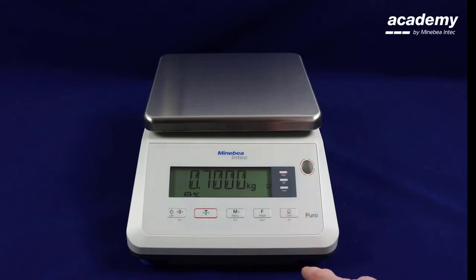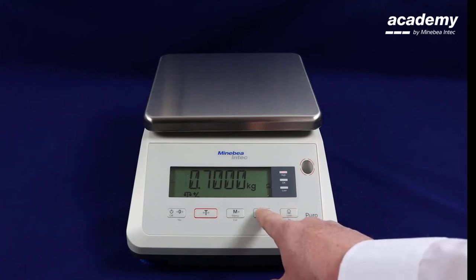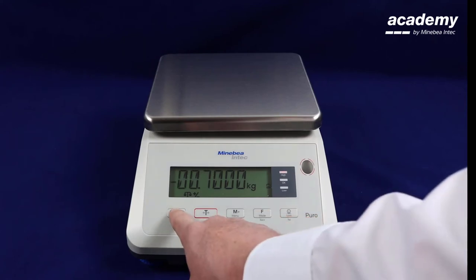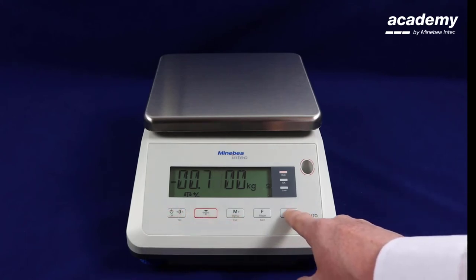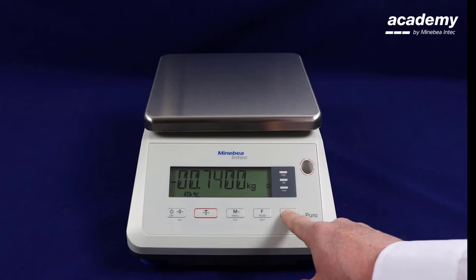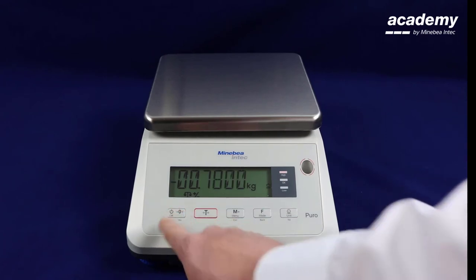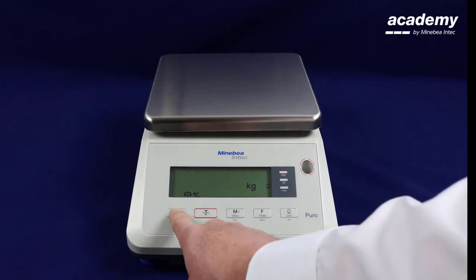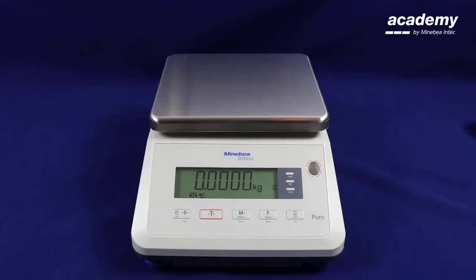The higher limit has to be lower than the lower limit. Press again to confirm. Now you are in the check weighing negative function.